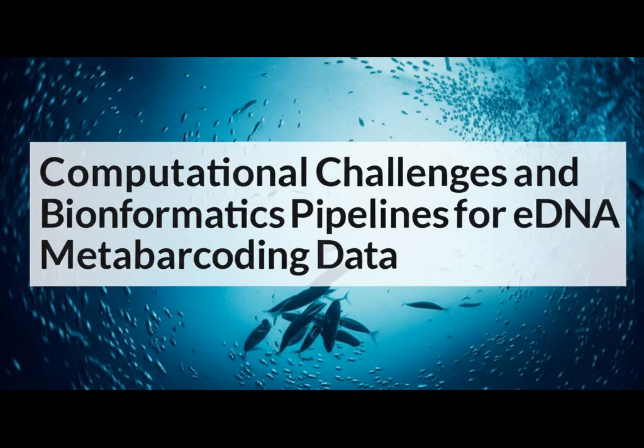Once we have these clean, representative sequences, OTUs or ASVs, we need to know what they are. That's taxonomic assignment. We compare them against large reference databases like GenBank or BOLD, using tools like BLAST to assign names: species, genus, family, and so on.